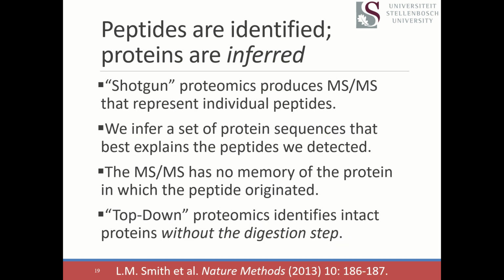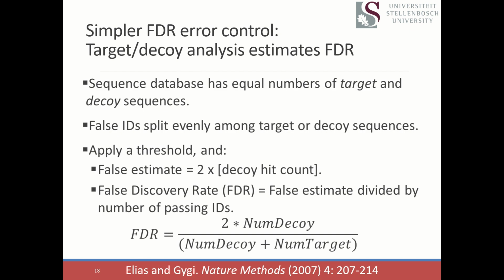We get to the last, oh yes sir. Just on the, or not the use, but some search engines, they require like a decoy set as part of the FASTA. Yes. And I'm just thinking of MSFragger in particular, or rather FragPipe, that uses PeptideProphet after MSFragger. Yes. That requires a decoy set. But PeptideProphet uses this discriminant score. So how do they fit together?